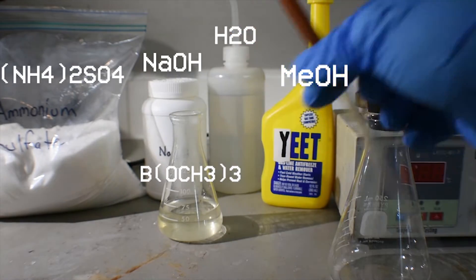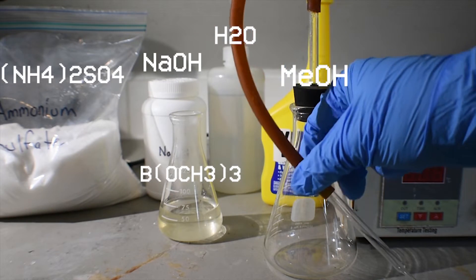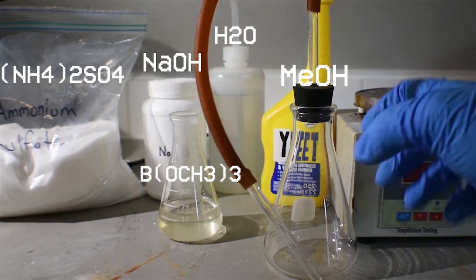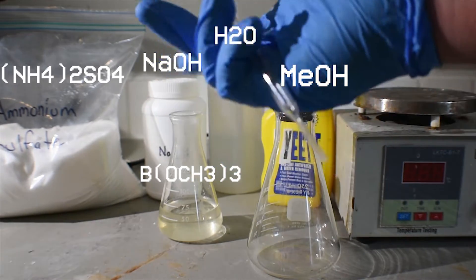As far as glassware goes, really just something to do the reaction in as far as the addition goes. You will also need some sort of bubbling apparatus. Here I just have an Erlenmeyer flask connected to a hose and a pipette that will lead the ammonia into the trimethylborate.